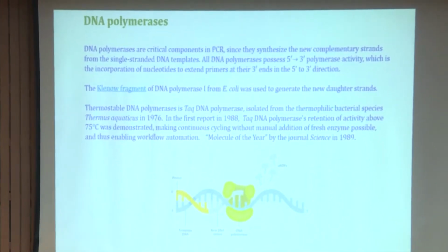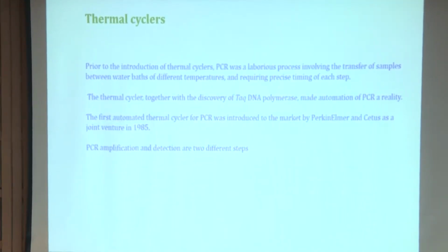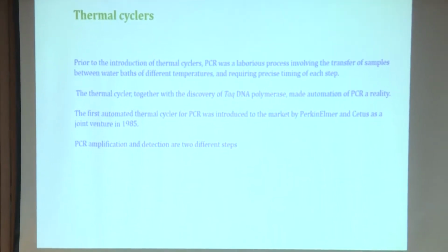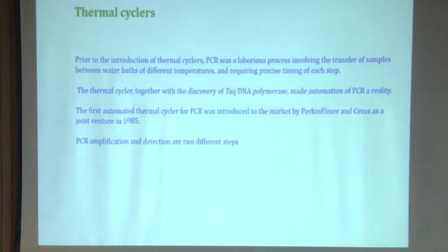The point is what has been made easy for us, in the sense that you are able to bring in the Taq polymerase, and also you are able to bring automation into the PCR reaction. Otherwise, they were putting the reaction in each water bath. Every time they had to remove the reaction and then immediately go to the next one when they wanted to alter the temperature.